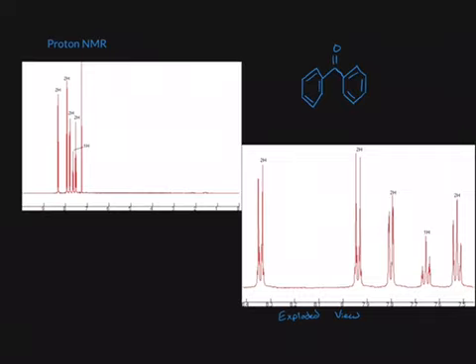And lastly, remember the nitrogen-oxygen bonds that we possibly had. We do need to throw that in there since we do have a nitrogen. So we're going to just go ahead and put it here. Nitrogen is used. We have an oxygen and an oxygen coming off, which is a nitro group, but we usually have a double bond to one of the oxygens.